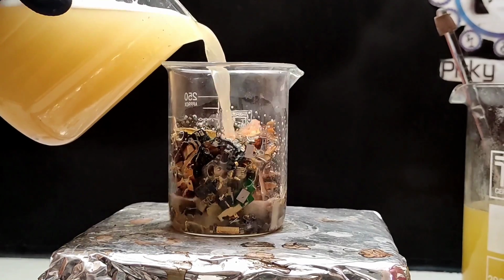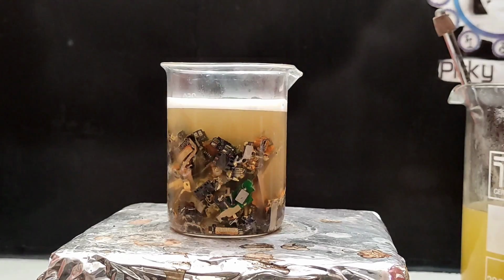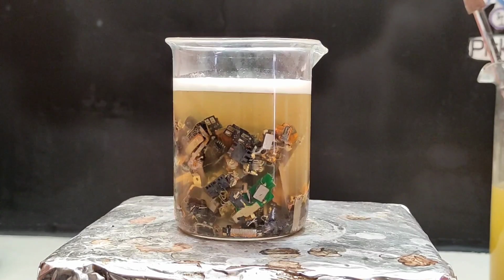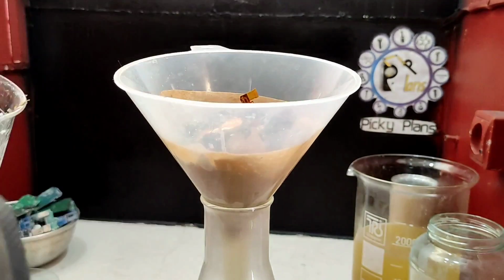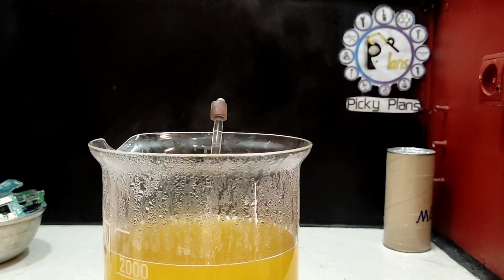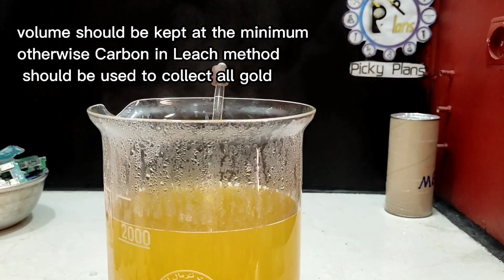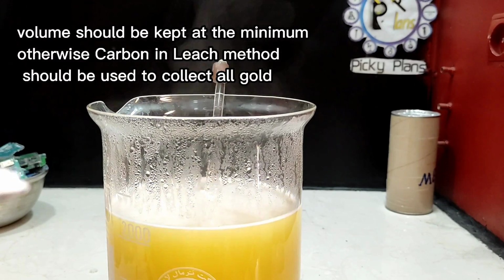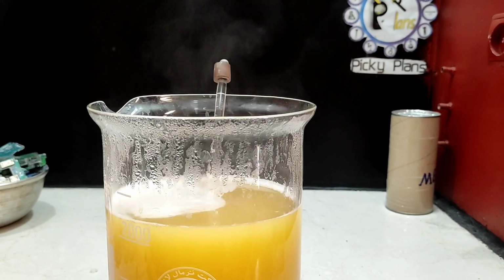When the leaching process of all PCBs was done, I prepared another batch to process pins. I let the pins sit for 1 hour just in case, to not lose any trace of gold. Afterwards, all gold containing solution was filtered. Solution volume remarkably increased due to the preparation of some experimental batches. I heated the solution to increase reactivity with zinc powder. Then I started adding excess sodium hydroxide, about 120 grams, to prepare the solution for addition of zinc powder.